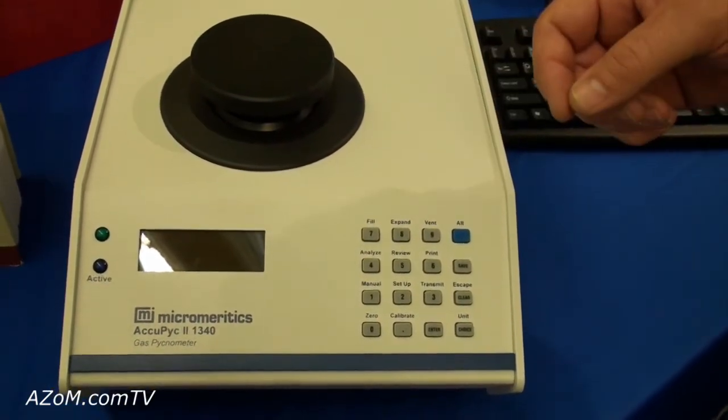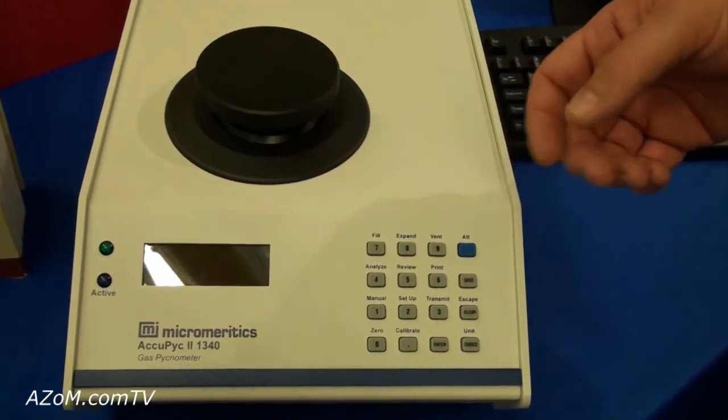If I know the mass of the sample, then the instrument can calculate true density based upon that.